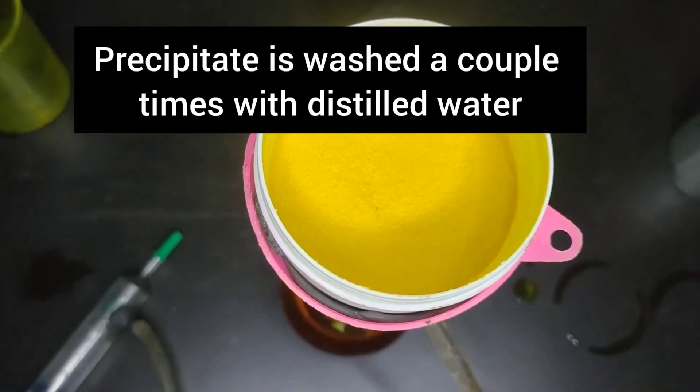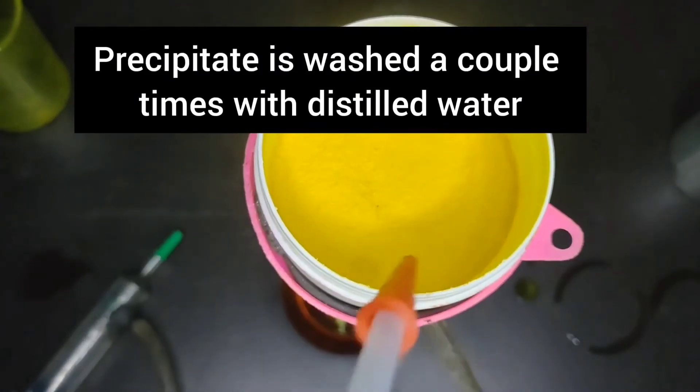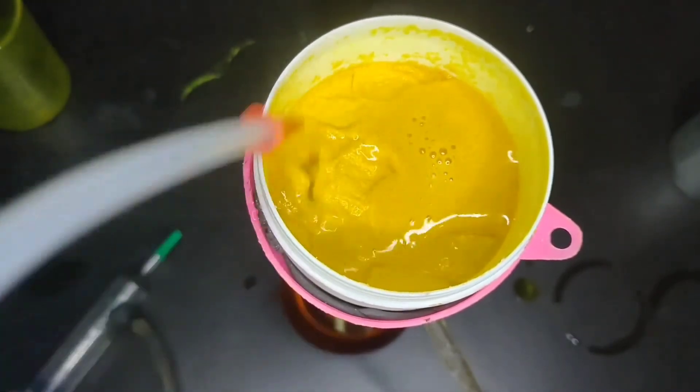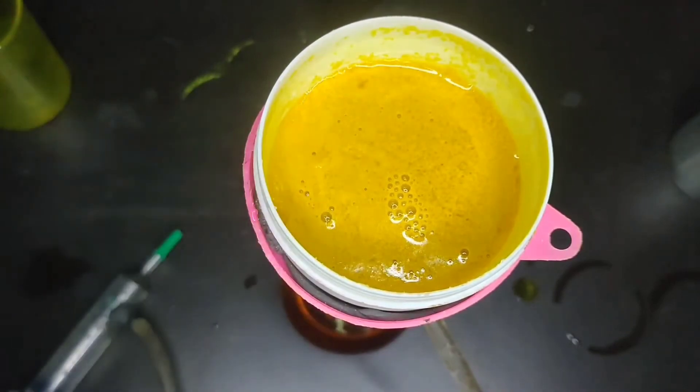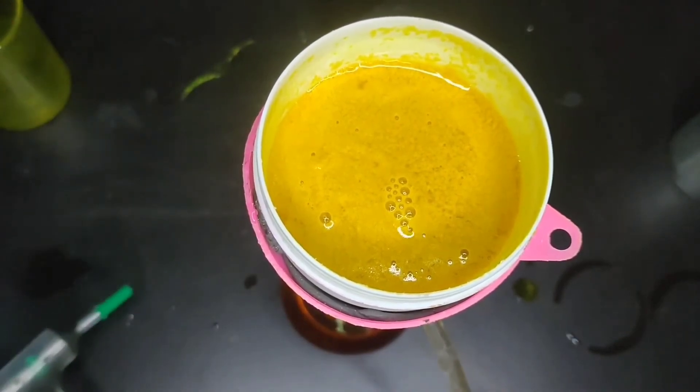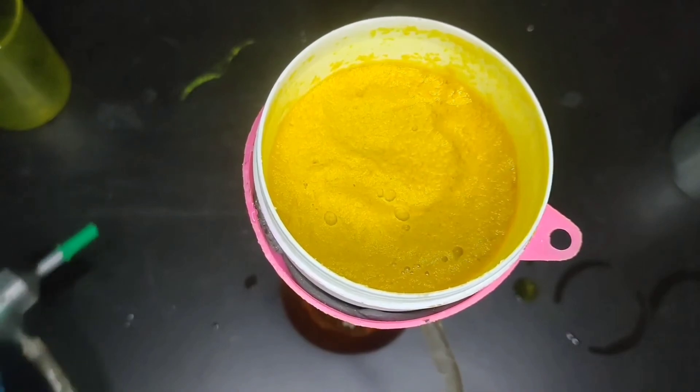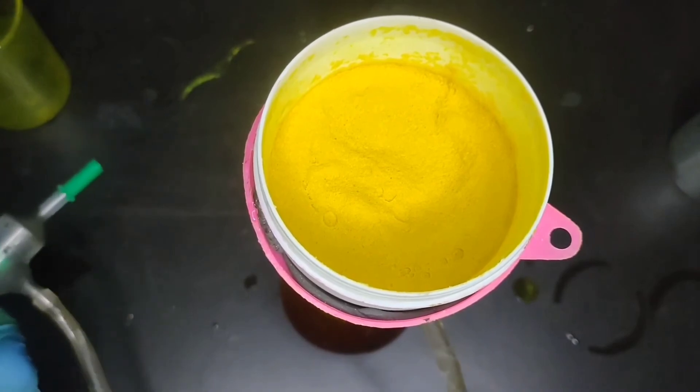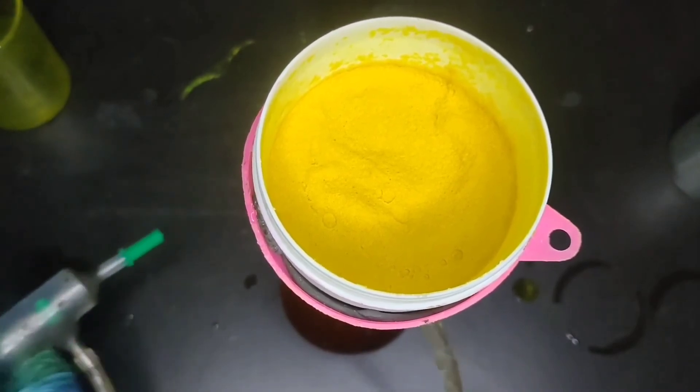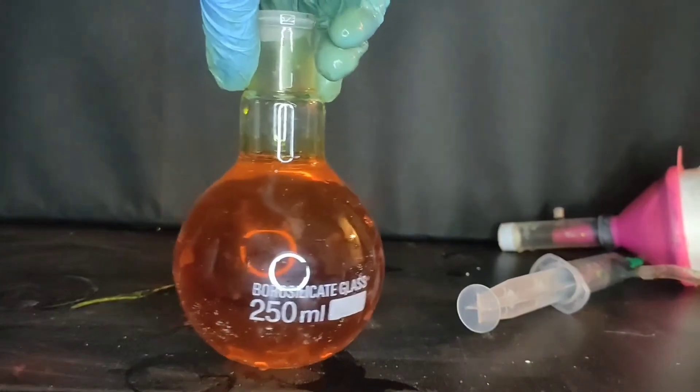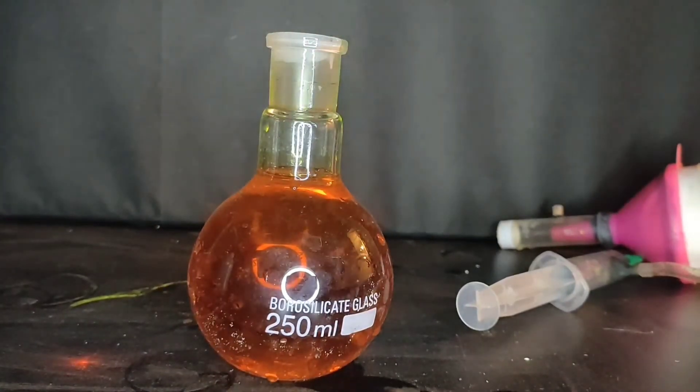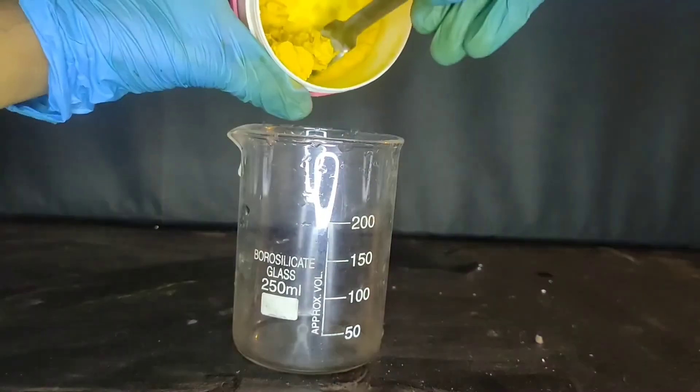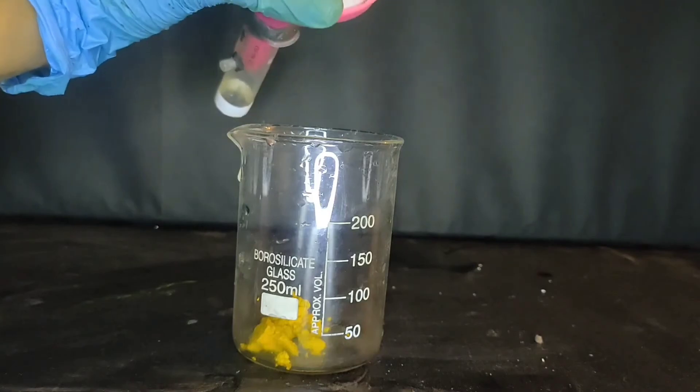The precipitate is washed a couple of times with water. The orange color of the filtrate indicates that there is ortho-nitro aniline present inside the filtrate, so this was discarded. And the precipitate is transferred into a beaker.